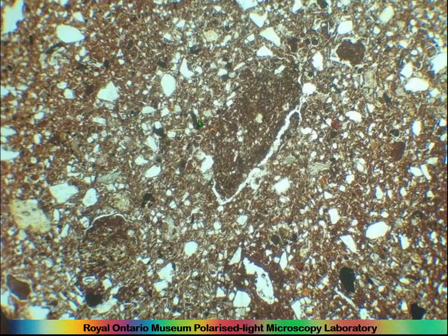Here you can have a lot more silt, and this seems to have a lot more of the clay. And this looks like it represents the original clay-rich component, both of these things. So they look like clay nodules. Here you can see another, it completely fuses into the surrounding matrix. And here.